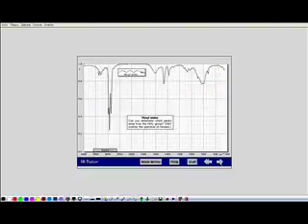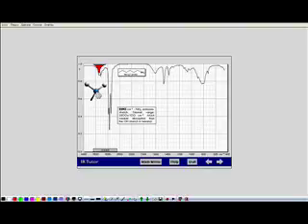Amines with the NH groups tend to be less intense. They're very close to 3400, 3500, but they're much less intense. And it turns out that the important one to remember for an amine is that if you have an NH2, you get a little doublet pair in the 3400 to 3500 wave number region, like this. And that comes about because there's an asymmetric stretch and there's a symmetric stretch of the NH2 group. And so in this case, when you see a little doublet pair like you see here, that indicates that you have an NH2.